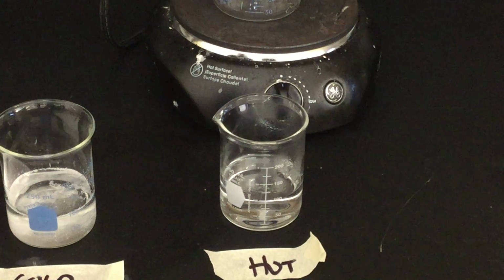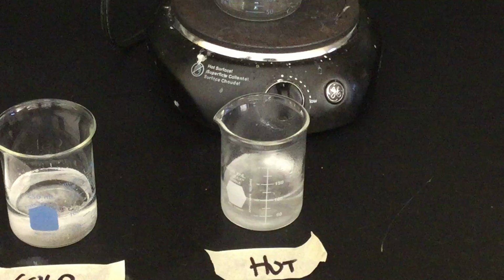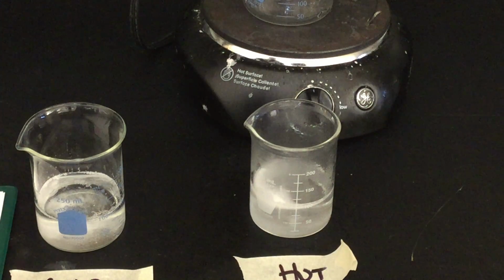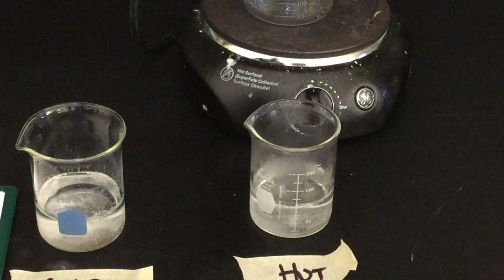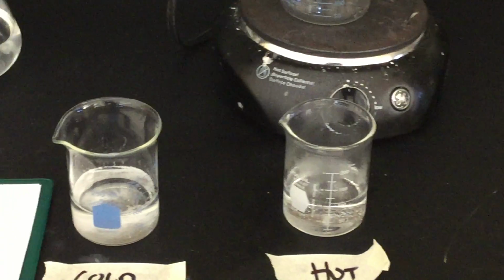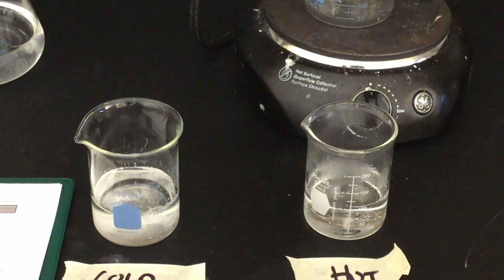So how fast is it going to take place in the hot water? We're going to reset our timer, start it, and then drop it in the hot. Okay, you should notice the reaction is much more vigorous. Okay, it's done. It's about 17 seconds, 18 seconds if I'm rounding. This again shows that the hotter the temperature, the faster the reactions are going to take place, and that's because the molecules are moving faster.